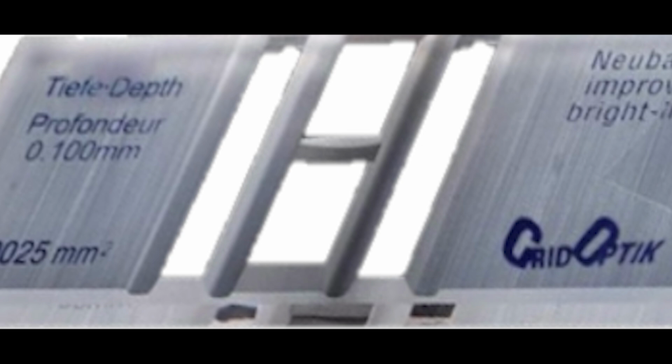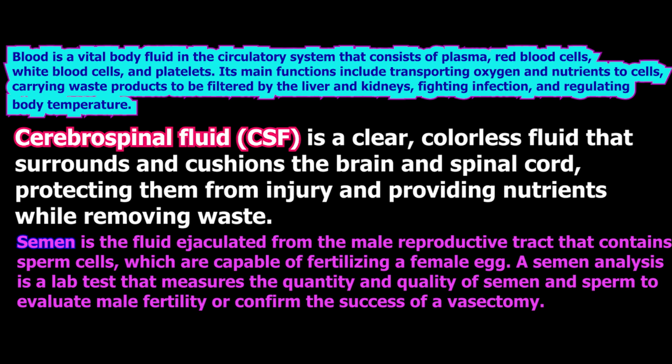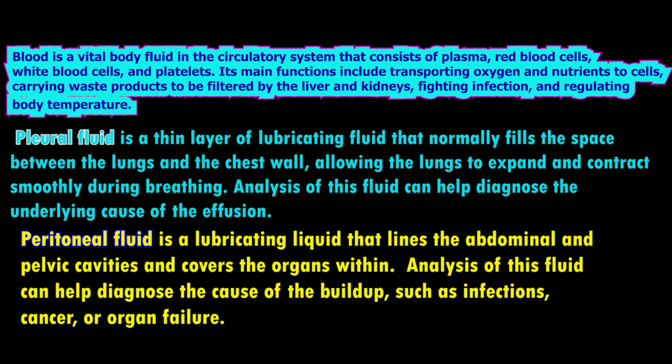Some of you have a question about the calculations in manual cell count using Neubauer counting chamber. This video explains the calculation. The cell count is done on a body fluid that may be extracellular fluids like blood, transcellular fluids such as cerebrospinal fluid, synovial fluid. This provides lubrication and cushioning for organs and joints.